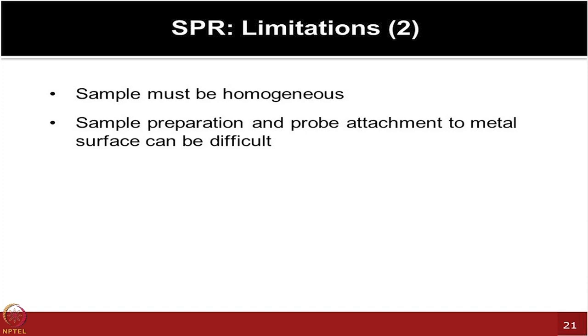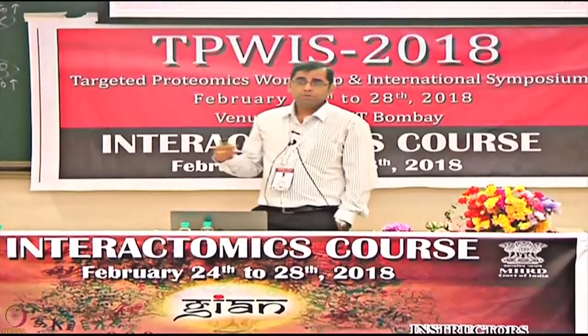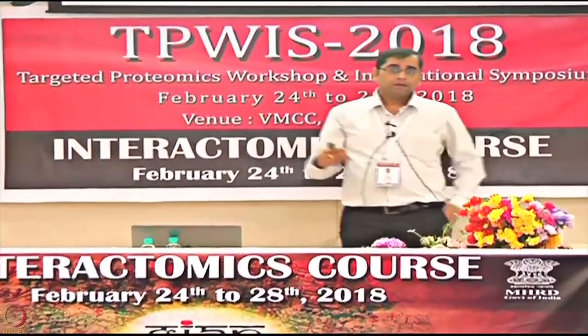You have to ensure that your washing and all kinds of cleanup steps are well performed. Otherwise, you will have many non-specific interactions. To ensure that you are getting a specific signal, it's a good idea to have a lot of positive controls, and you can vary the concentrations of those and see the lowest concentration at which you can still measure those signals.